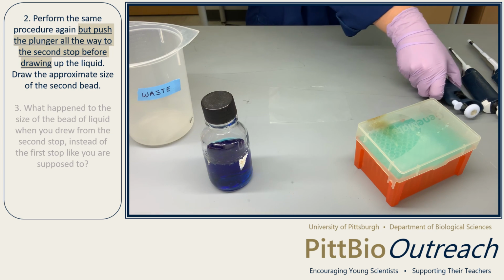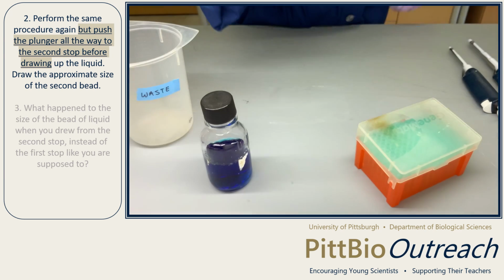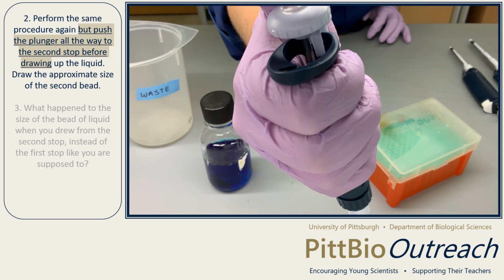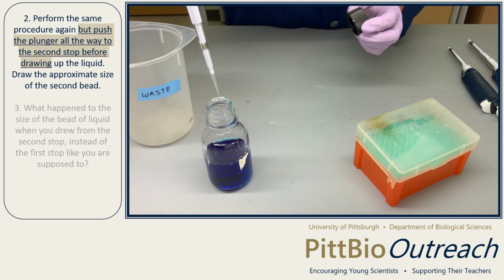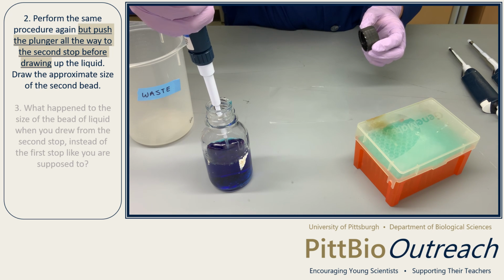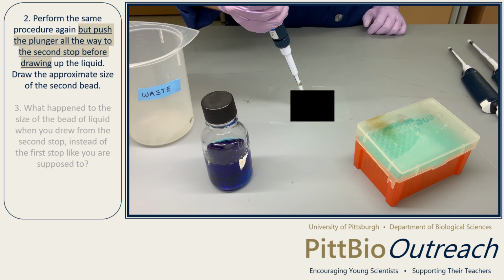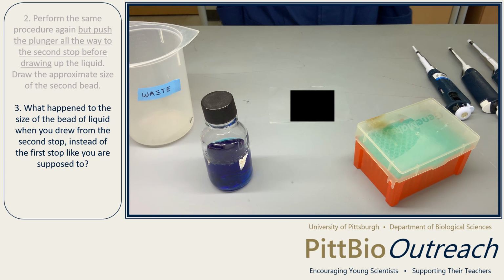Step 2. Perform the same procedure again, but push the plunger all the way to the second stop before drawing up the liquid. Draw the approximate size of the second bead below. Step 3. What happened to the size of the bead of liquid when you drew from the second stop, instead of the first stop like you are supposed to?